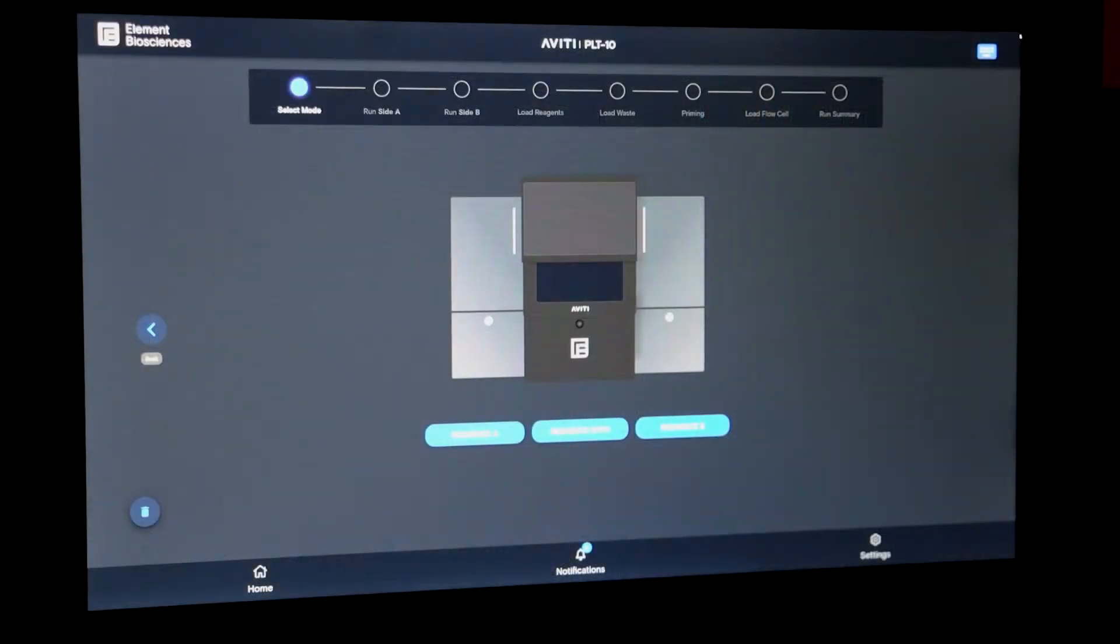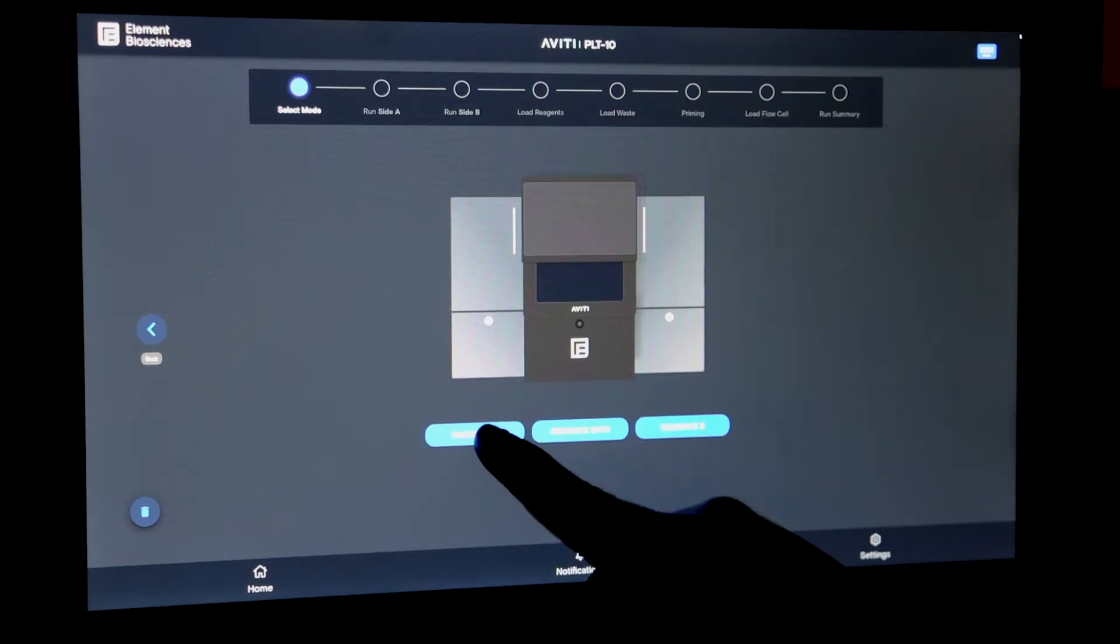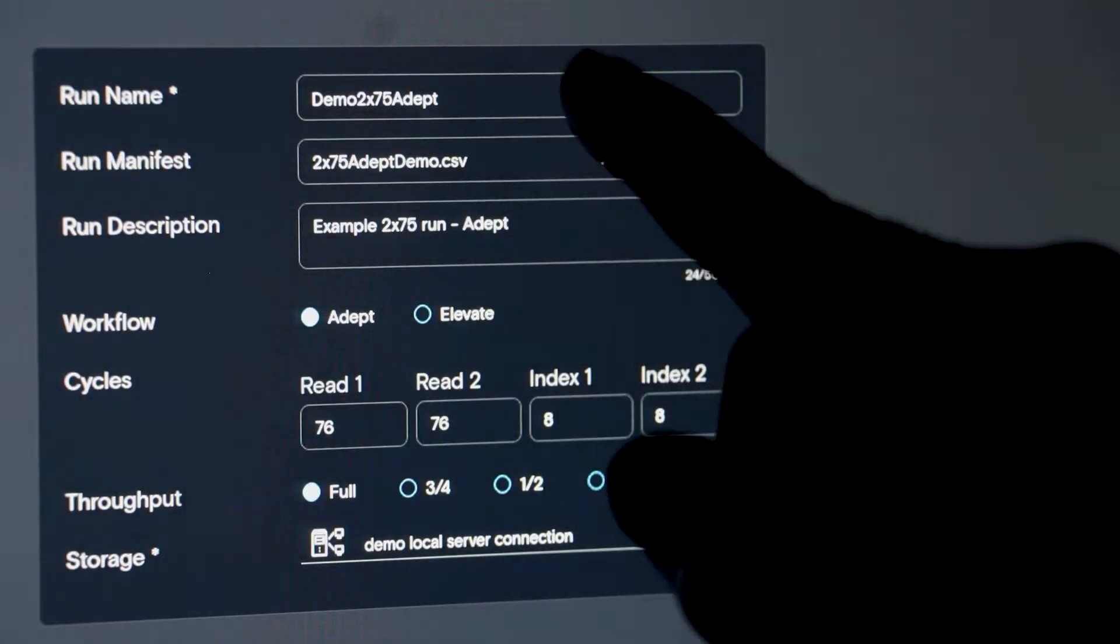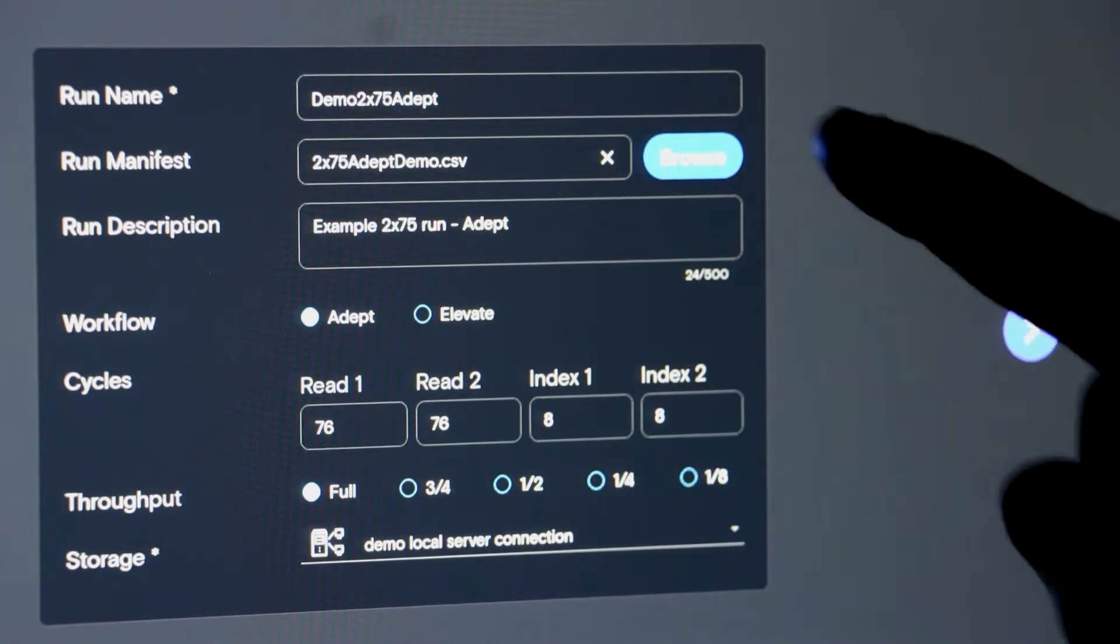The Aviti operating system will not only walk you through each step by alerting you that you've properly completed it, but it will also show you where you are in the process with these breadcrumbs. We begin by selecting side A and entering the name of the sequencing run, then select the protocol that you previously designed and uploaded using our run manifest software.